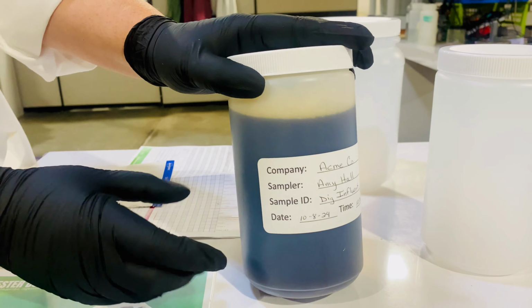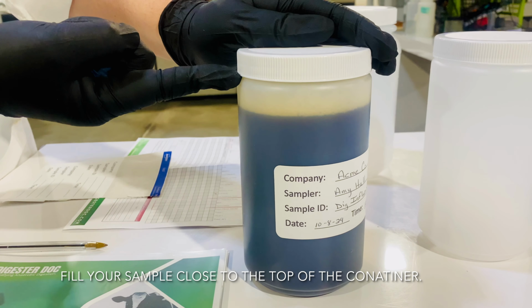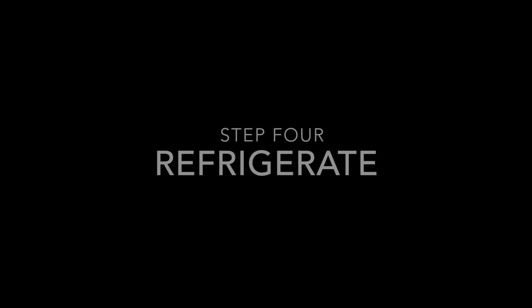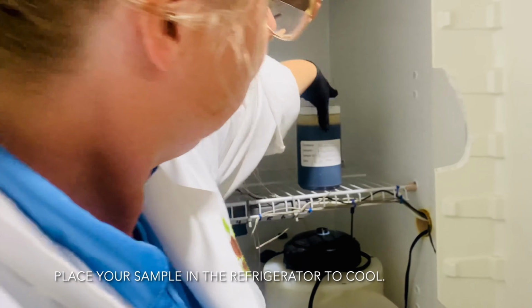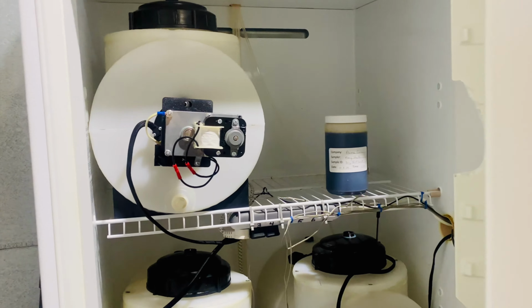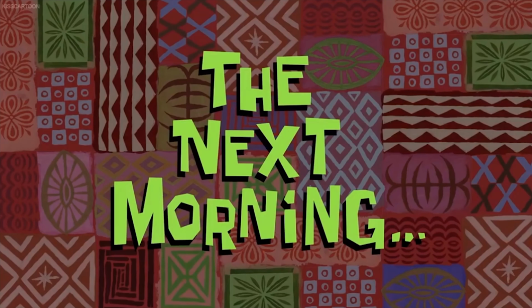Make sure your sample bottle lids are tightly secured before packing them. Please fill your sample bottle near the top of the container. Also, it's very important to let your sample cool before shipping it. This helps preserve the quality of your sample and ensures it arrives in the best condition. The next morning.